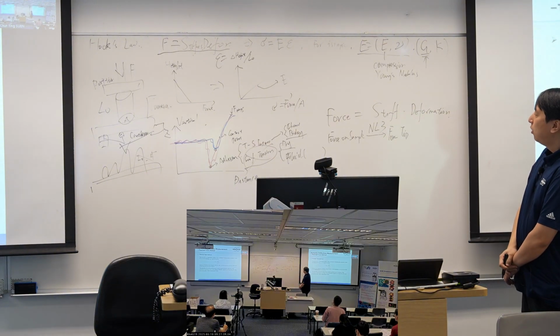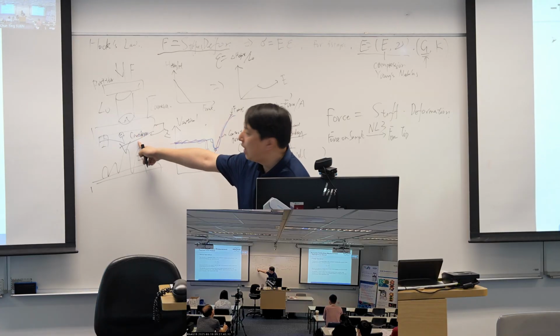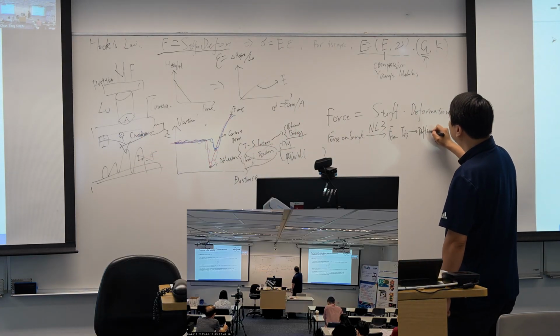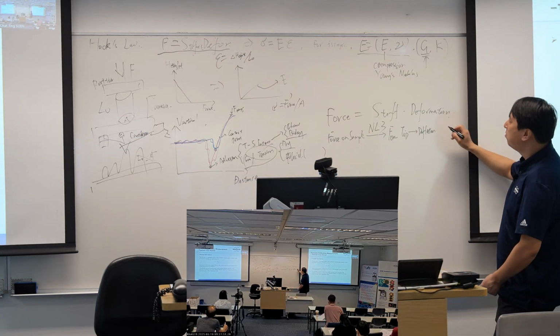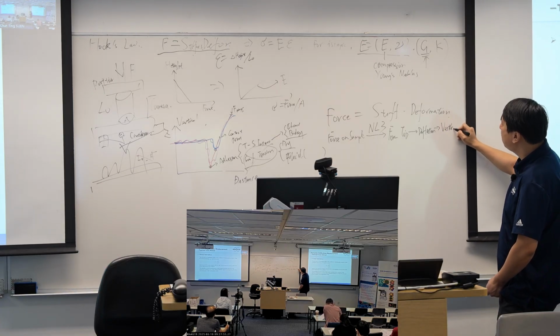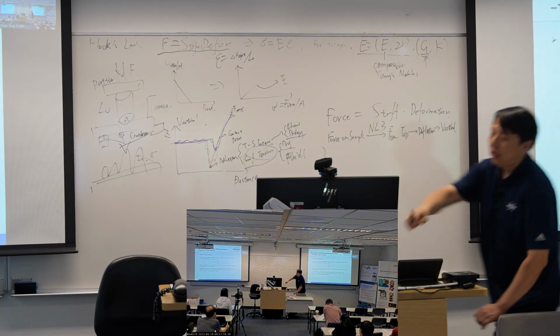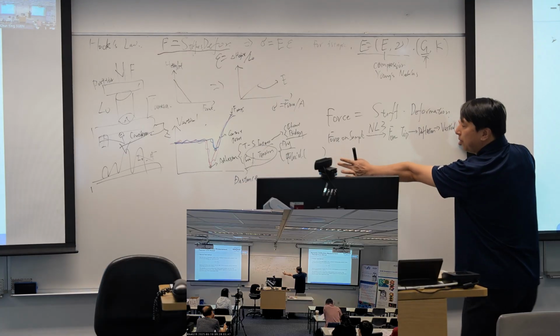And then the force on tip, we change it to the deflection of the cantilever. And the deflection of the cantilever is monitored by the laser beam, which is captured by the vertical value and the lateral value. So our task here is to finish this roadmap.